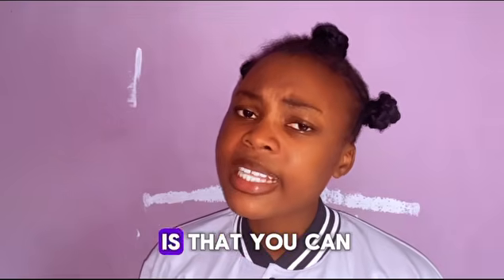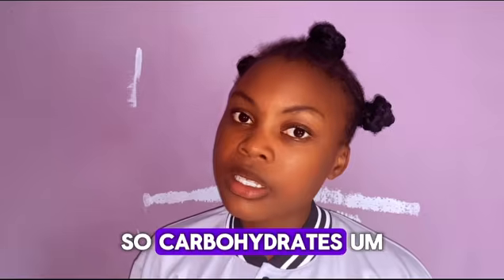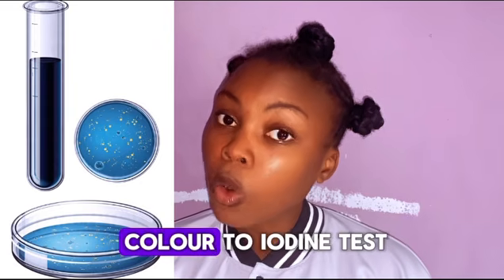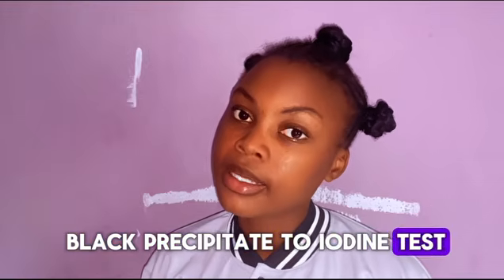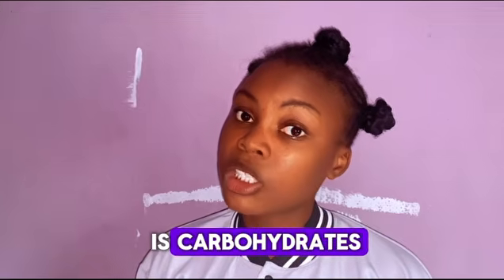And the second one is that you can use the iodine test also. Carbohydrates, let's say a complex sugar, e.g. starch, give a blue-black color with the iodine test. So this is how you'll be able to know if a substance is a carbohydrate.